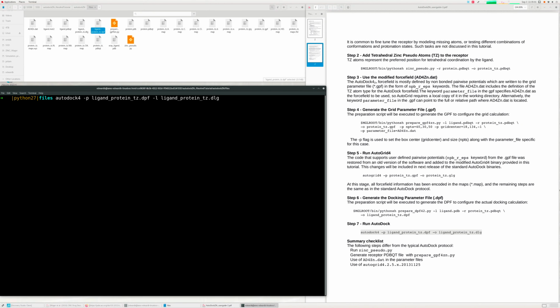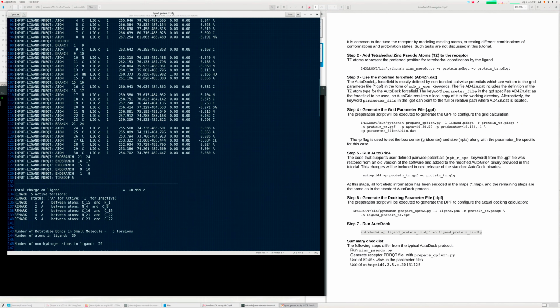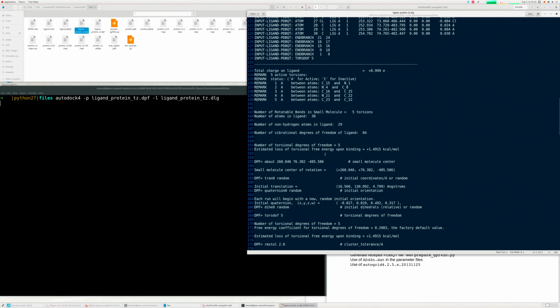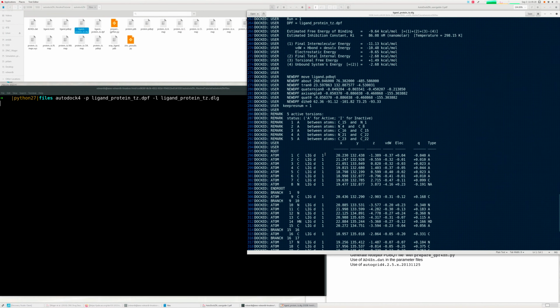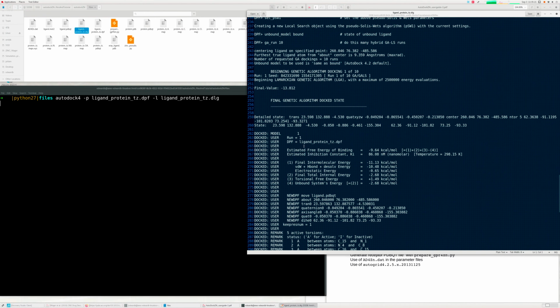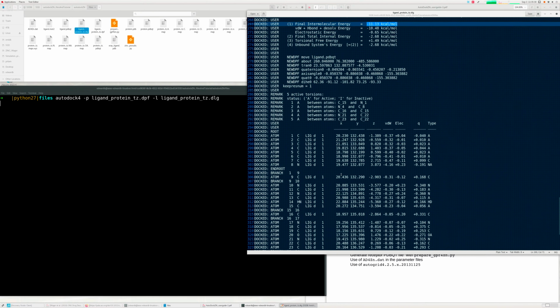And now you can see that your AutoDock docking has been running, so you can watch it by opening it in a terminal, or you can open the file and you can see that files have been created, and there will be run 1, run 2, run 3. So I think a total of 10 runs. And you can see the binding affinities, which is in kilocalories per mole.